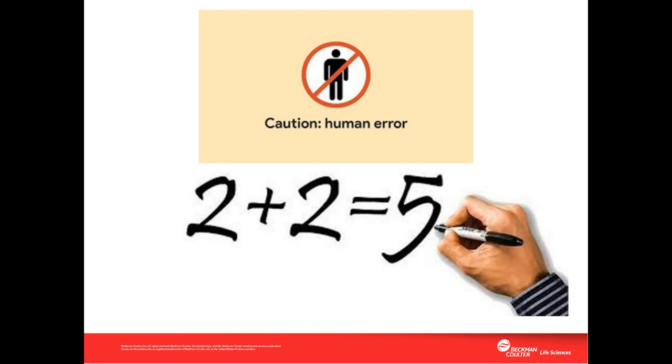And for the first time, they introduced the acronym ALCOA. I'm sure it's familiar to many of you, but it's used to describe what good data integrity looks like. The last A in the acronym ALCOA stands for accuracy of the record's data. What they're indicating is that security and safety of the electronic record is important, but it's not the only focus of 21 CFR Part 11. It's also important the electronic record has accurate information or data in it. Here they're suggesting that anything that contributes to improving the accuracy of an electronic record is a positive thing. They always encourage the use of the latest technology, such as automation of the SOPs, which tends to reduce the impact of human error.